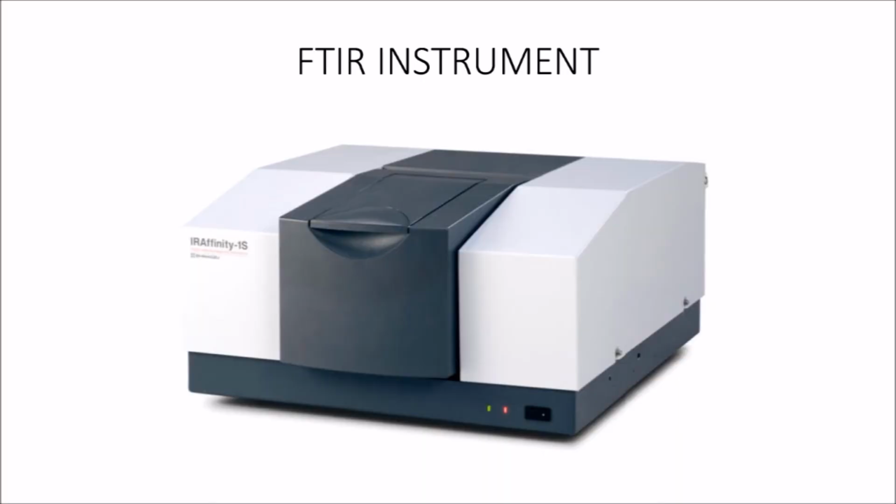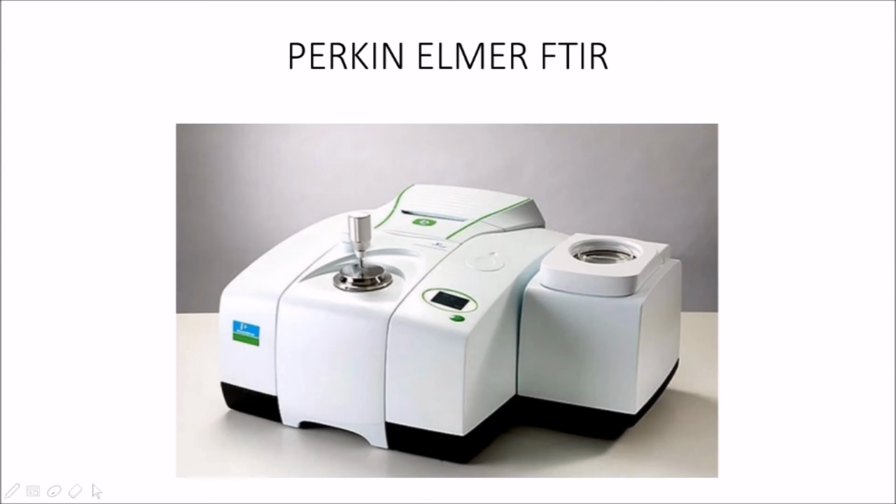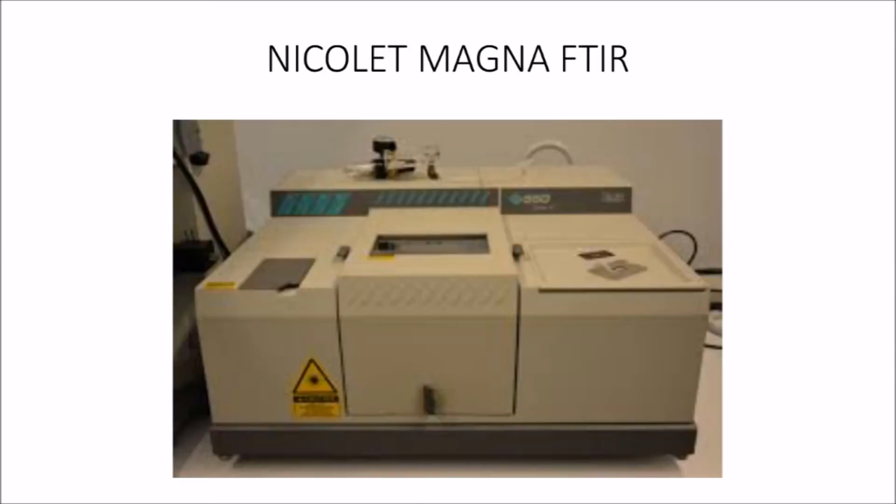Alright, now are you guys already know about the types of FTIR instruments? I will tell you about that. The first picture shows a common FTIR instrument that is commonly used in the laboratory. The second is the Perkin-Elmer FTIR. The third picture is the Nicolet Magna FTIR.